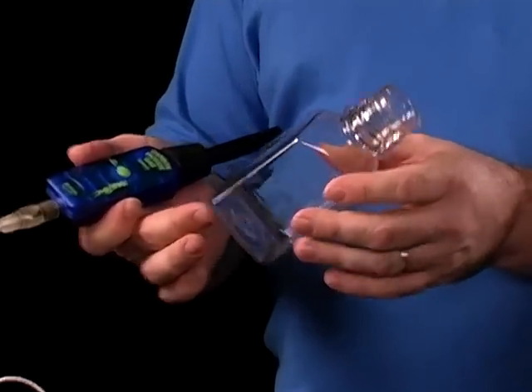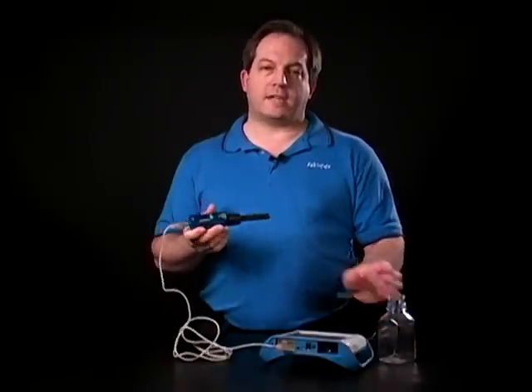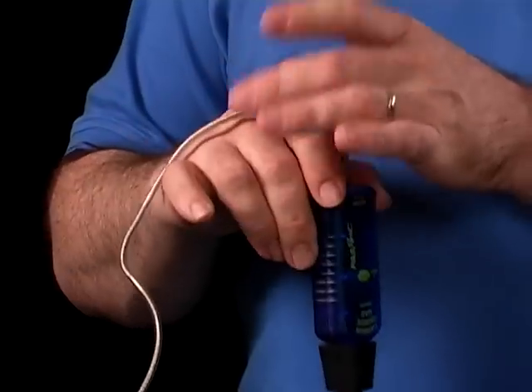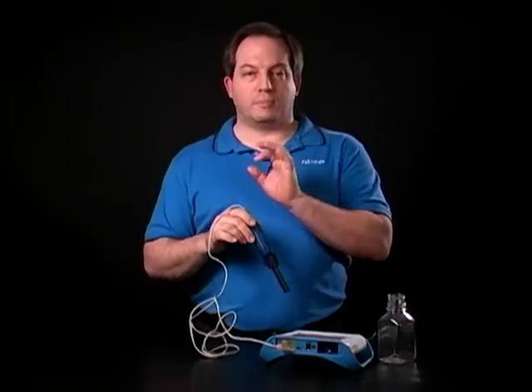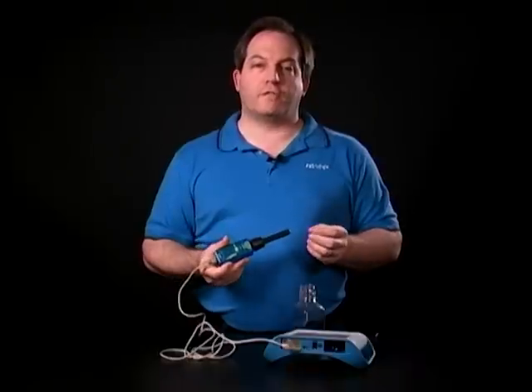Now we can use it to do a variety of different experiments. We could place samples back in the bottle and look at the CO2 change over time. We could take this out in the field and look at the exhaust coming from cars. We could put this in a bag using the extension cable and have students breathe into it to get the CO2 concentration in their breath. It's a great sensor for biology.